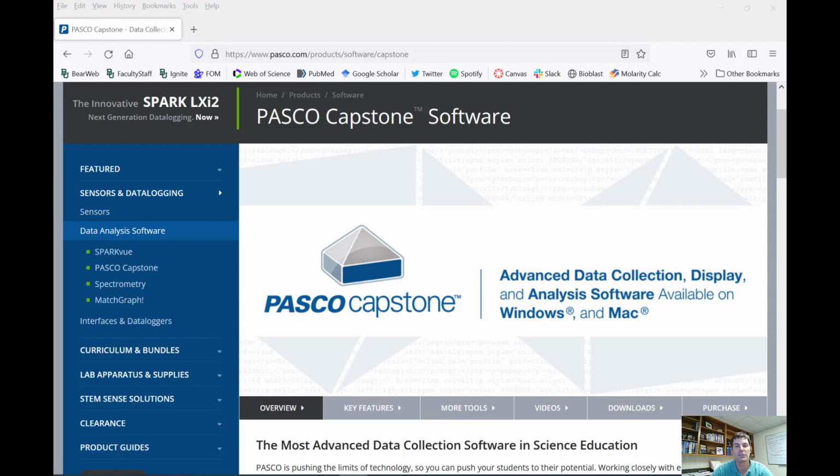The purpose of this video is to demonstrate how to analyze the reactive oxygen species data that we get from Ocean View. If you've worked or seen it in the lab, one of the things you'll notice is that software is not super user-friendly. And so we choose to do our analysis in a completely different software known as Pasco is the company and Capstone is the title of the software.